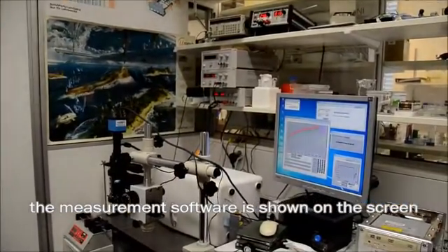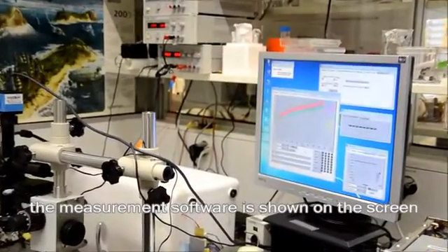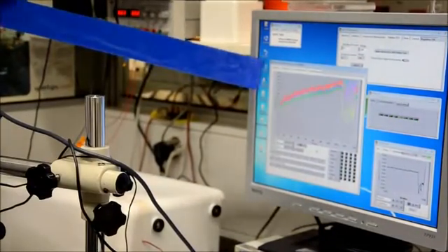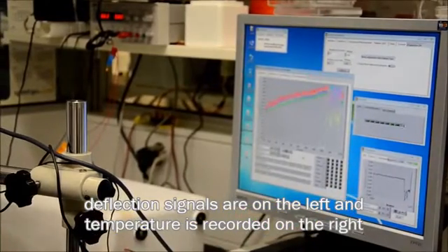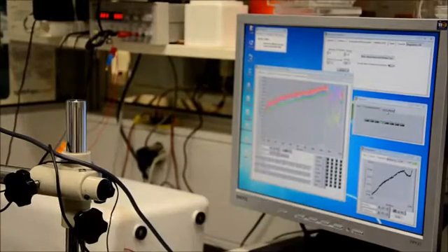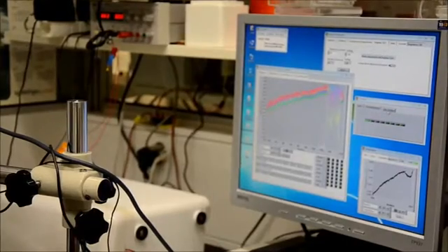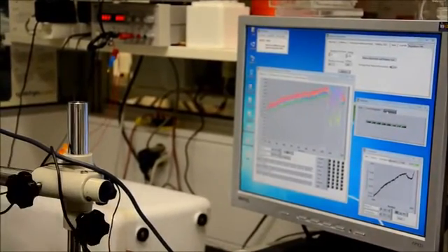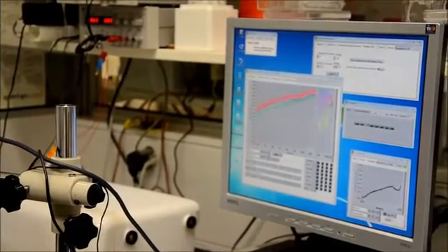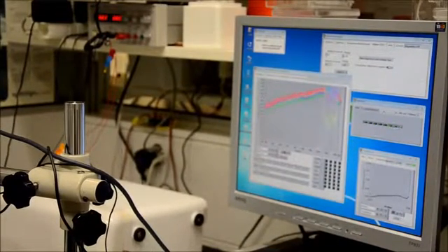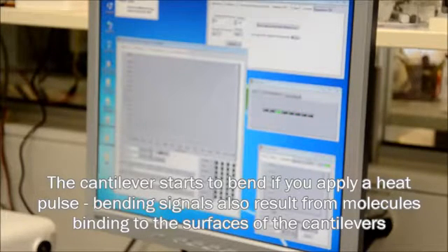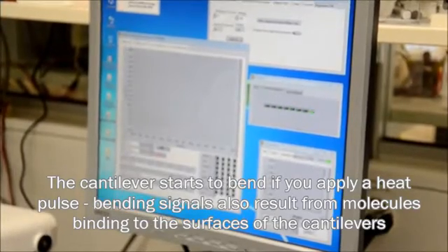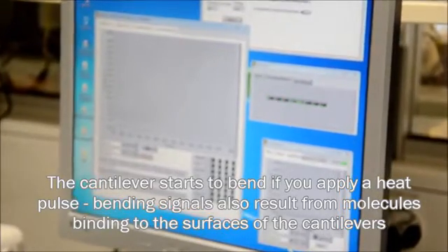The actual measurement software we can see here on the screen. I started an experiment to show you how the system actually works. You have here the deflection signals from a measurement. Then here is the temperature recorded. I can show you what happens if the cantilevers are bent. I do a temperature experiment where I briefly increase the temperature. The temperature increase results in bending of the cantilever. See the cantilever start to bend if you apply the heat pulse. This is the working principle. We have bending signals while you have binding of the molecules to the surface of the cantilever.